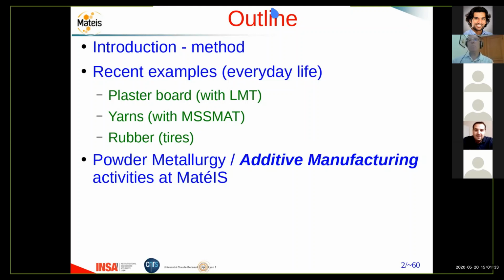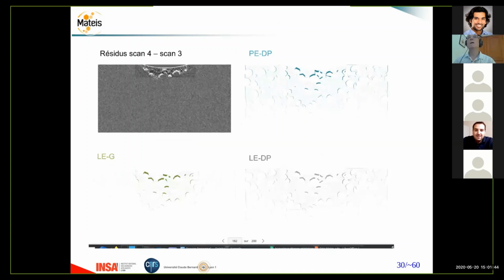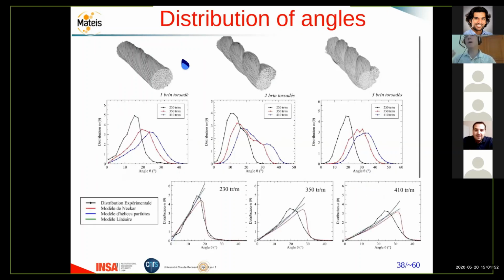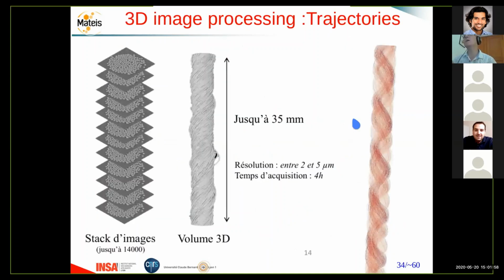Okay, we've done it many times. I try to find it. I think it's explained somewhere. So, as you anticipate, here, I think it's here. You see here, the whole point is to find the center of the fibers in one slice.